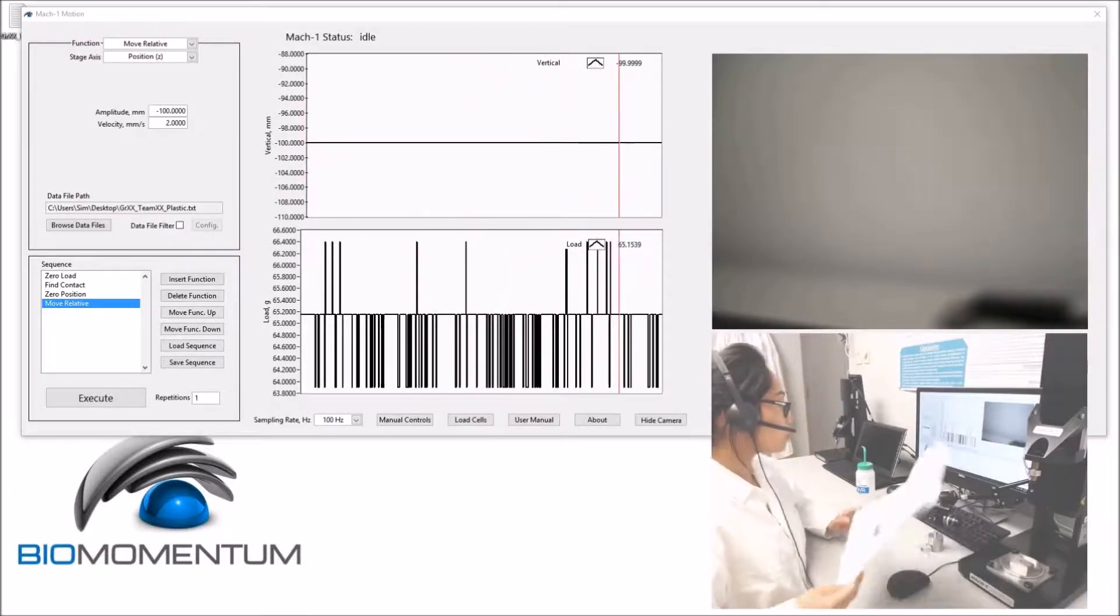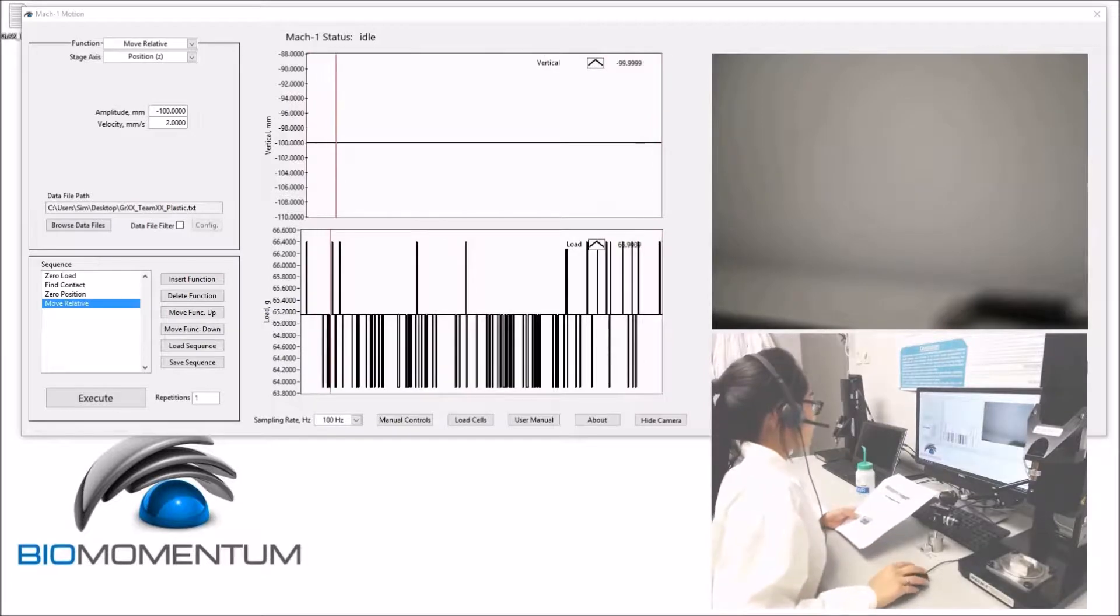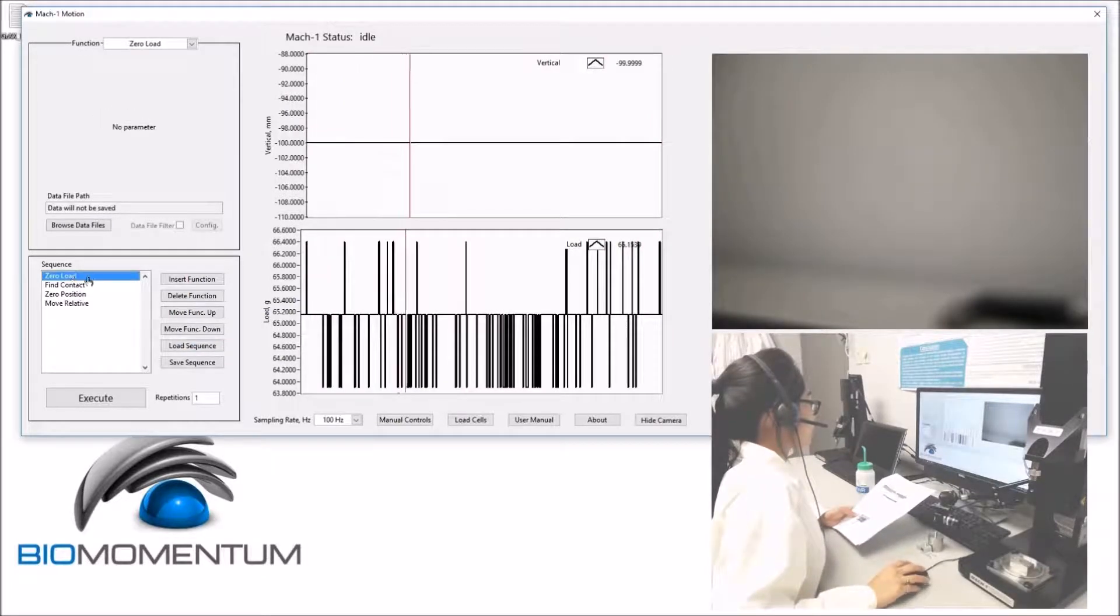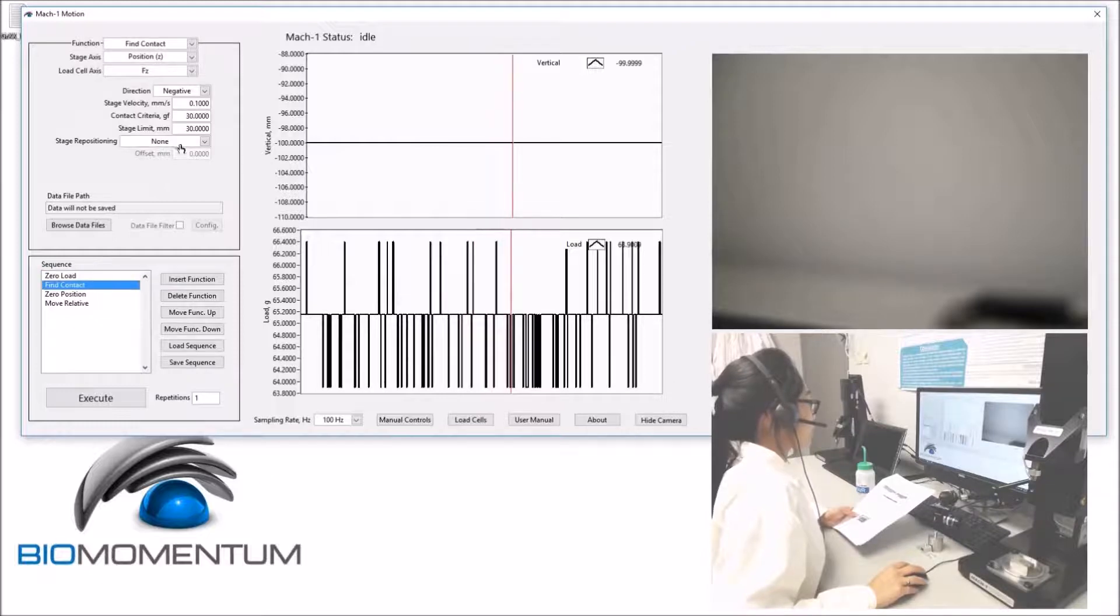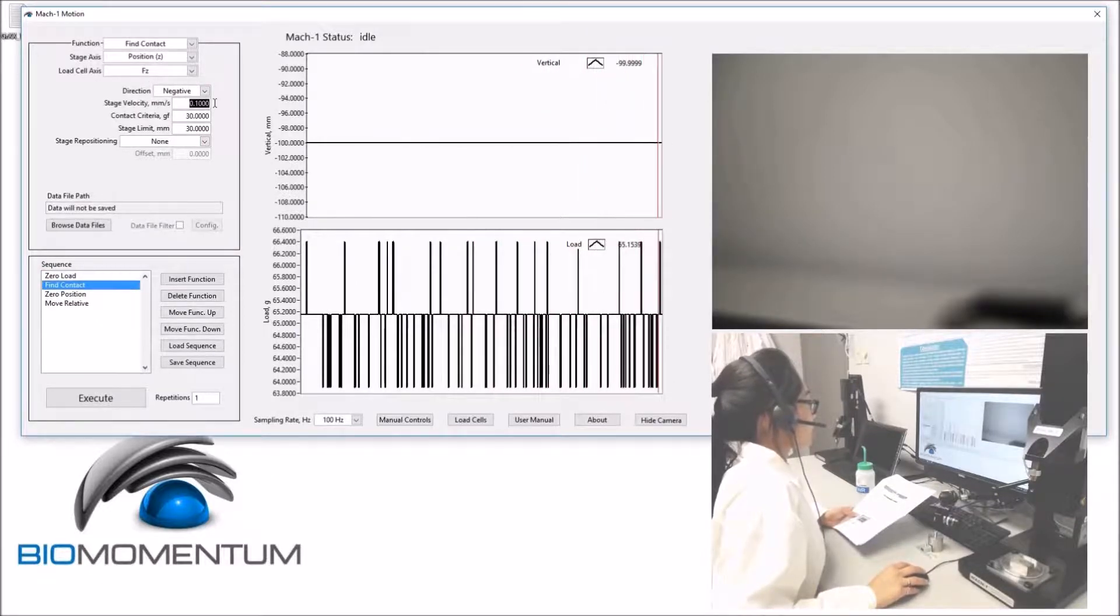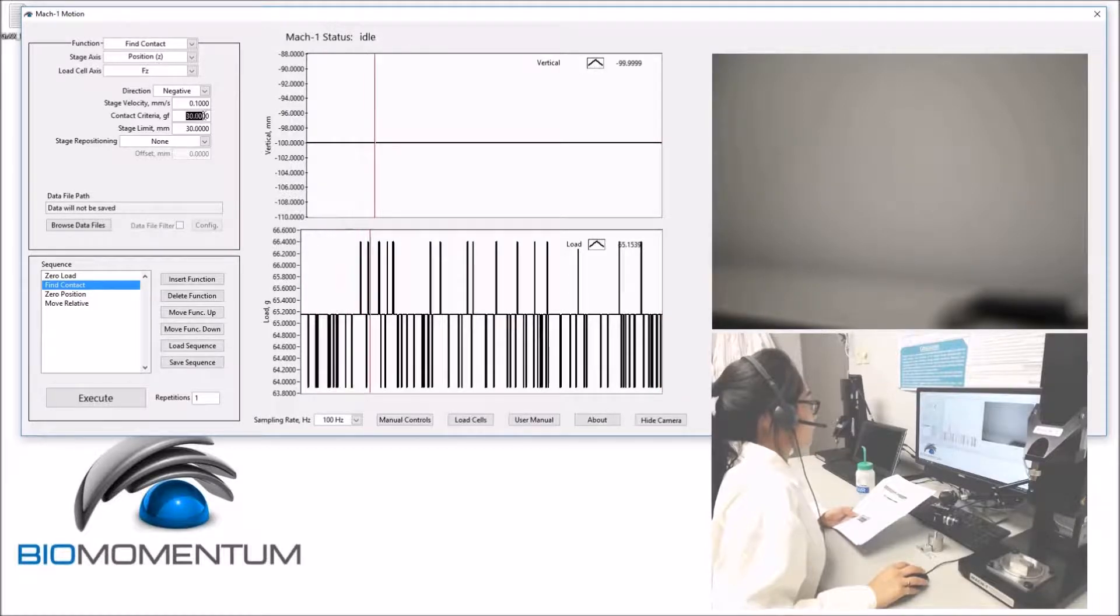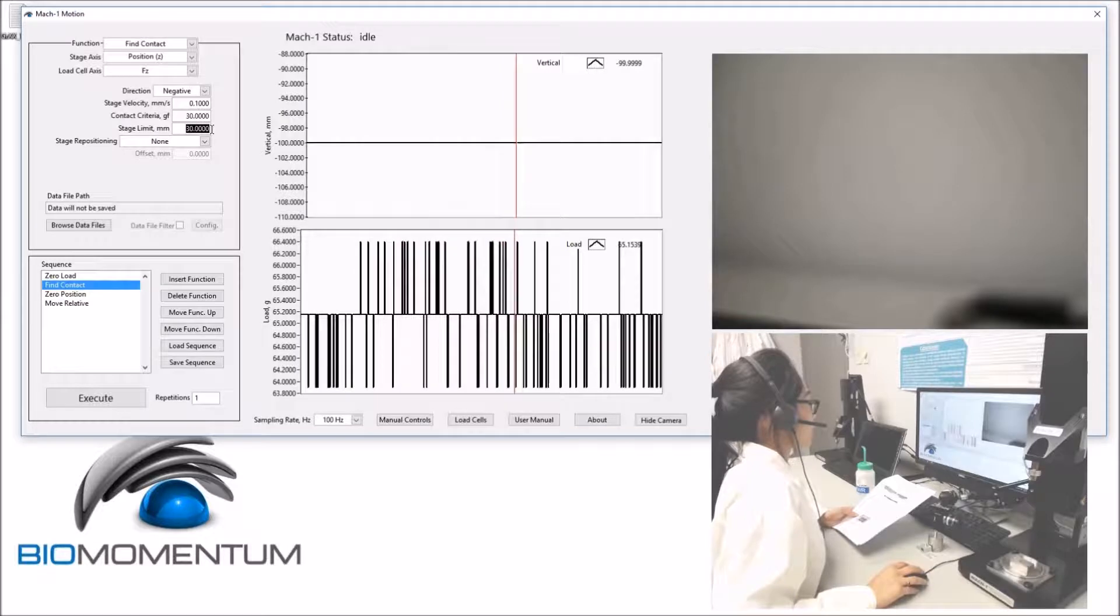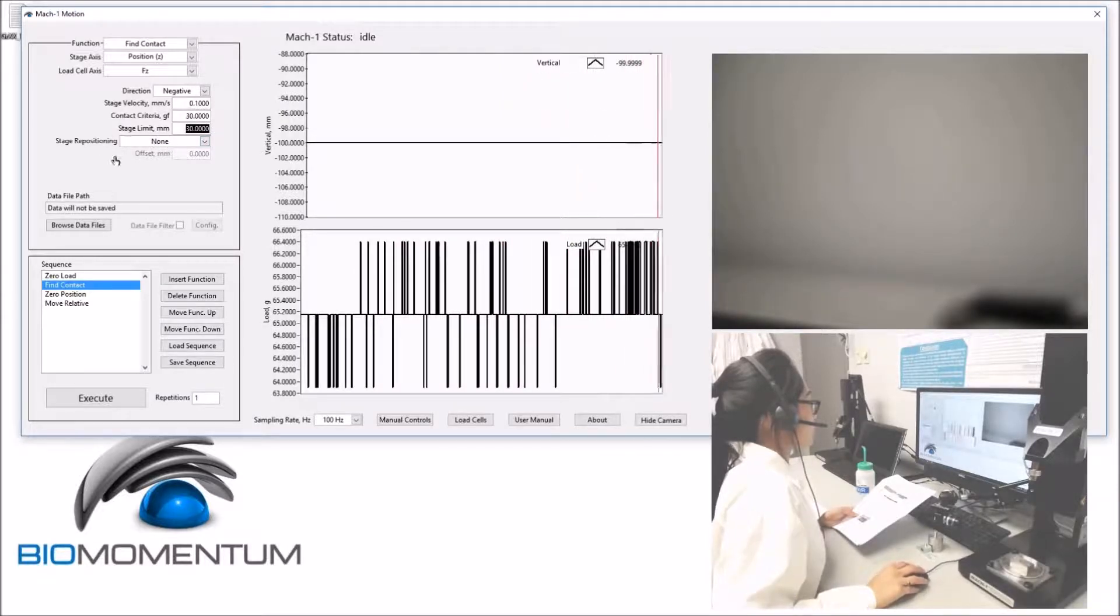Using the protocol, we will be using the same sequence, starting with zero load, a fine contact in the negative direction with a stage velocity of 0.1, a contact criteria of 30 grams force, a stage limit of 30 mm, and no stage repositioning.